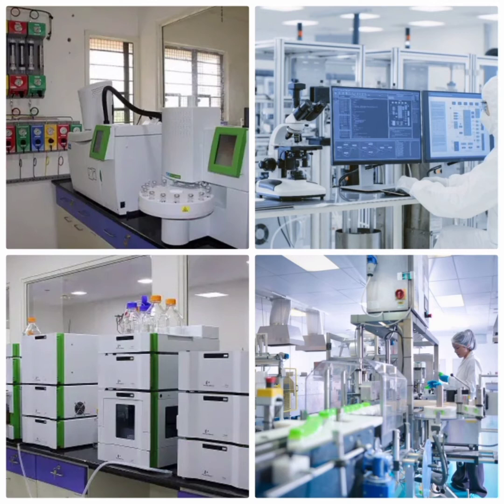Here are some examples of software provided by reputed suppliers. Those are, for example, PerkinElmer TotalChrom, Agilent ChemStation, EZChrom Edit, Thermo Scientific Chromeleon, and so on.